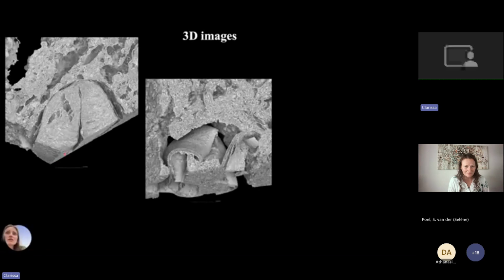In this one, you see a chili pepper, so the fruit, not the seed, the fruit, the red green part that is sort of intermixed in the matrix. And so these things are rather easy to see. Obviously, it depends on the temperature that you're burning it at, but you can still see them.